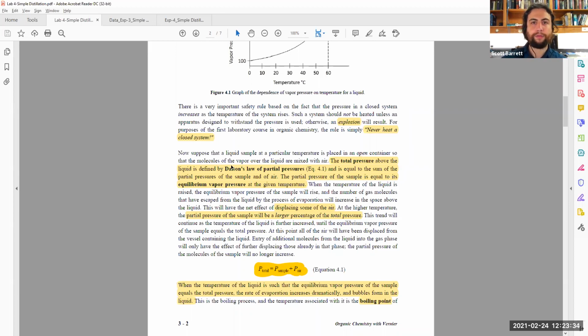If we were performing vacuum distillation, there is always an exit for the pressure, going outside of your vacuum device. So it's not technically a closed system, it's a reduced pressure system. There's an exit going out of the pump that is pulling, or in the case of a sink that you probably utilized in Gen Chem, where you turn the water on to pull the pressure from a system, like in vacuum filtration, the water is acting as the exit of the system.